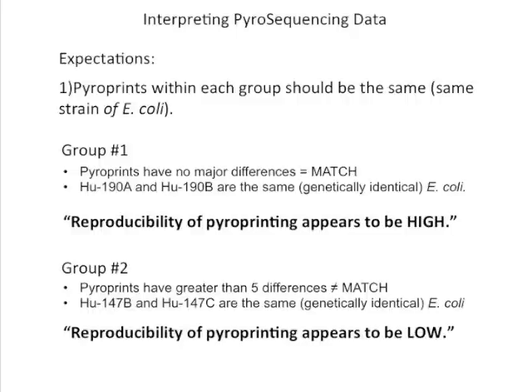These are the things that I look for when I'm analyzing the pyroprints and looking for differences. Don't be afraid to draw on your pyroprints, circles, arrows, question marks, notes to yourself, whatever you need to clearly identify those differences. And as always, don't be afraid to ask your instructors for help if you have any questions.